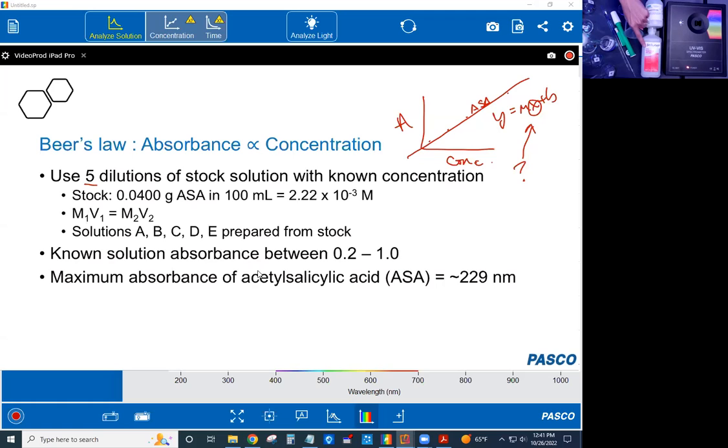This is 91% isopropyl alcohol. It's the same kind you get over the counter at a grocery store or a drugstore. So that's the solvent we're using, isopropyl alcohol, and 91% for the best dissolving in solution.